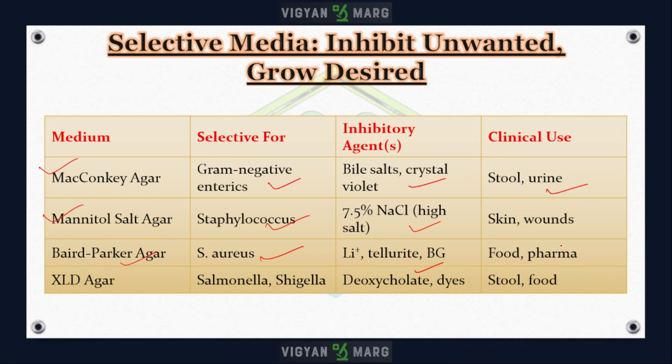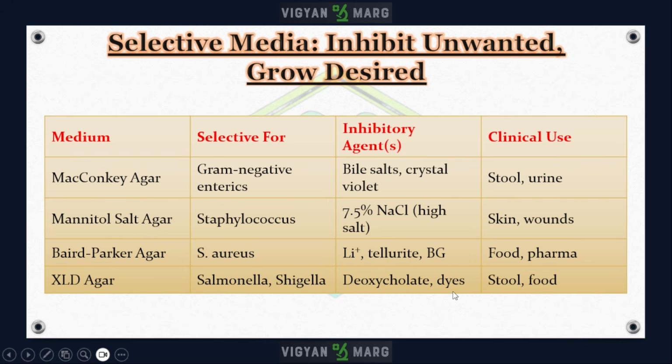It is commonly used in food and pharmaceutical microbiology to detect Staphylococcus aureus bacteria.